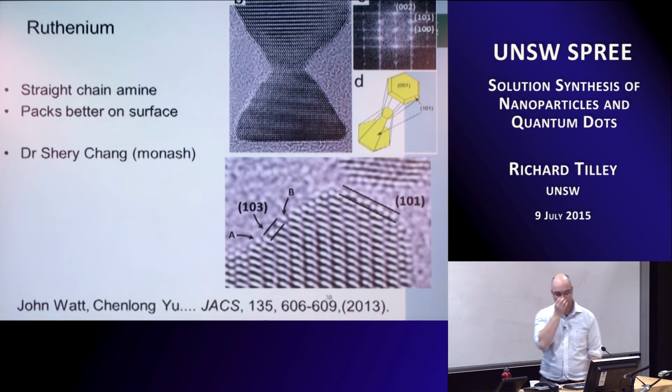And this is some high-resolution transmission electron microscopy. So we can always go backwards and explain how we managed to make the shape. Essentially we have some high-resolution electron microscopy, and we can see all the surface atoms, and then work out what surface facets you have on the particles. And it's what surface facets you have that essentially control the shape.